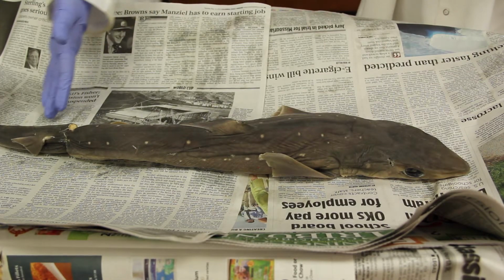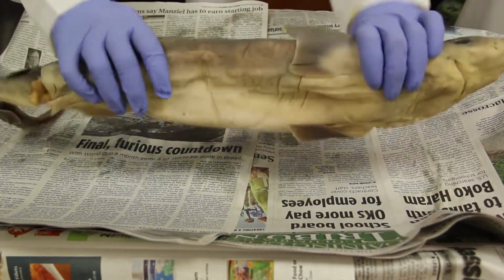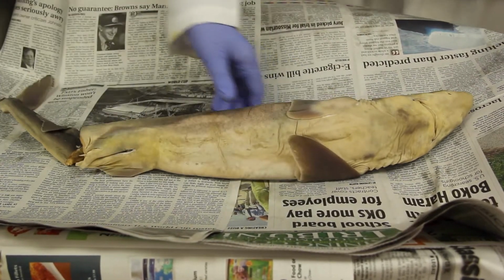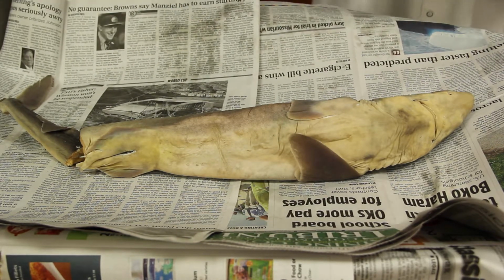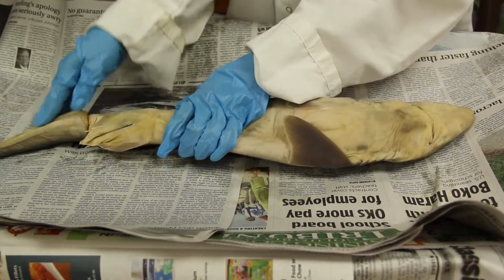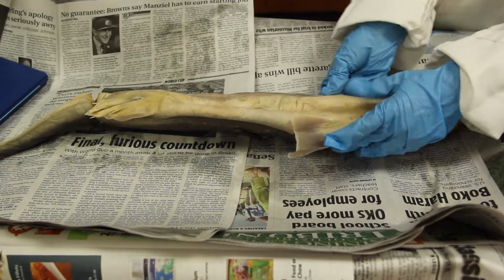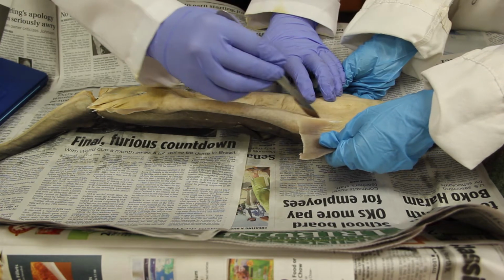So now we're going to start on to the actual dissection. We're first going to place our shark with the ventral side up, which is his belly side up. And you know that this is his belly because it's the lighter side of the shark. And then we are going to take our tools and take a scalpel. We're going to make a shallow cut from his pectoral fin and then down to his tail.